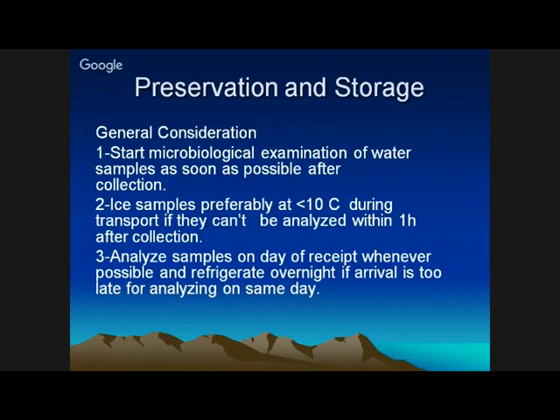Keep samples preferably at less than 10 degrees during transport, if they can't be analyzed within 1 hour. Analyze samples on the day of receipt whenever possible, for the bacteriological parameter or the BOD, the biological samples. As soon as the sample reaches the laboratory, at least on the same day, it should be put for analysis.